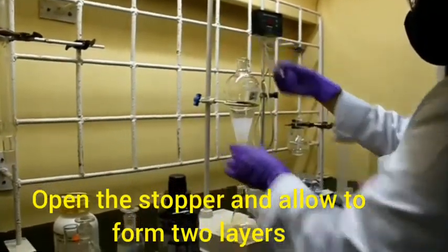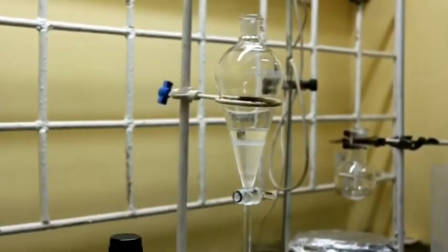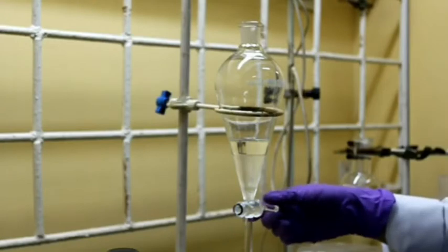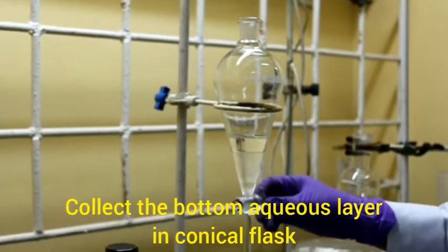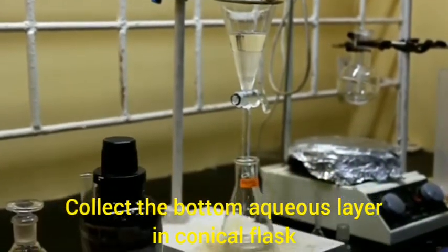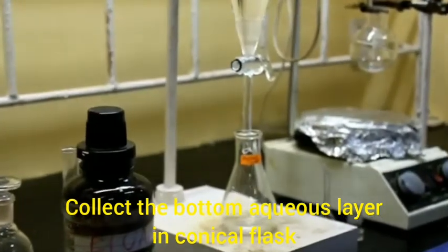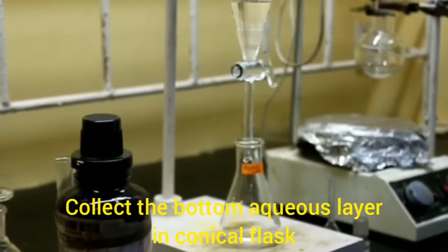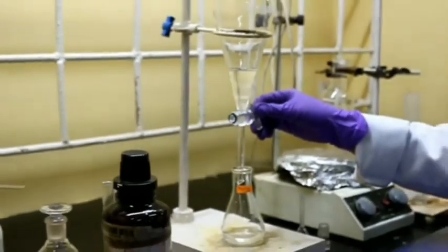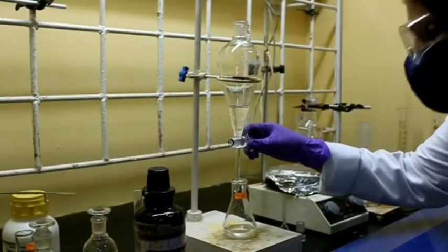Now open the stopper and allow it to form two layers. You can see two layers. Collect the bottom aqueous layer in a conical flask. Be careful, otherwise the organic layer will also come with the aqueous layer.